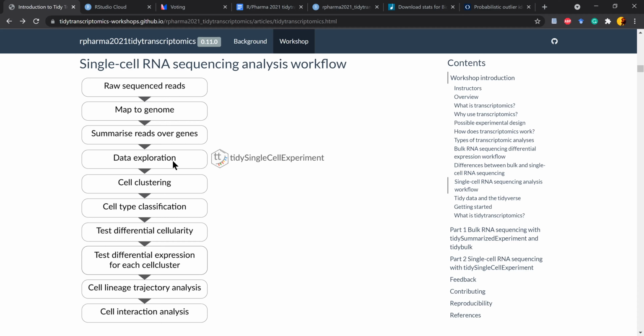So we have the dimensions: how many transcripts we have, the cells that we have, and if we have a multi-sample analysis, as is common these days, we have also sample information. And so you can imagine you can have a much higher resolution of your data. You can start to do a much more complex and informative analysis.